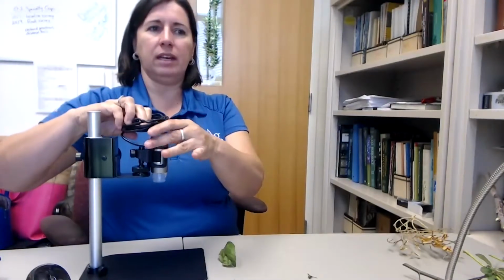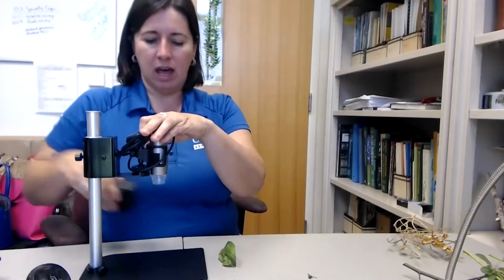It's good for your master gardeners. It's good if you're kind of in a pinch. Very few agents have both a dissecting scope and a compound scope. This is really nice, with the new budget coming up. You would still use your same Dino-Lite, and then you would use the backlight, and then you would lower it, okay?